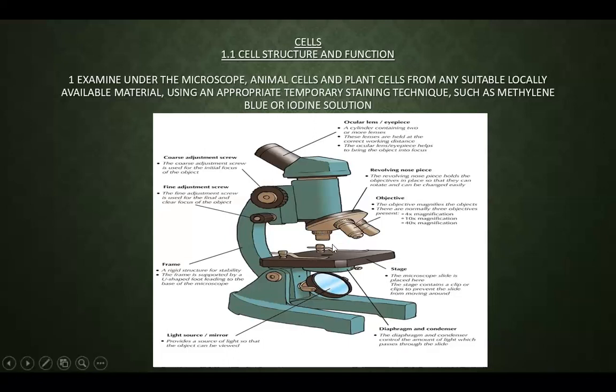And with the help of these stage clips, once you know where your specimen is present, you can fix your slide so that it does not move. It stays focused. So with the help of the stage clips, you can keep the slide at its own position, at the proper position, right?